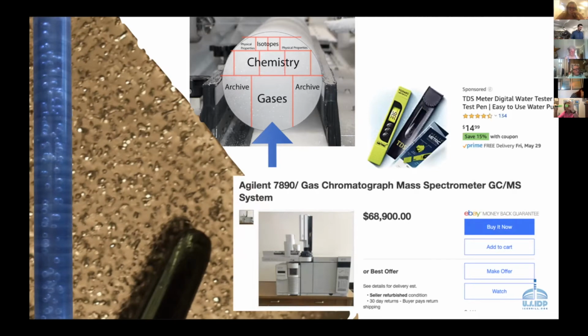Vernier makes some conductivity meters as well. You can do this lab with Vernier. But then when you turn it on, you should see that it starts to read. And we're looking so that on the bottom, there's different scales here. You want the units to be microsiemens per centimeter. A little mu sign, an S per centimeter. Microsiemens per centimeter is a measure of conductivity.